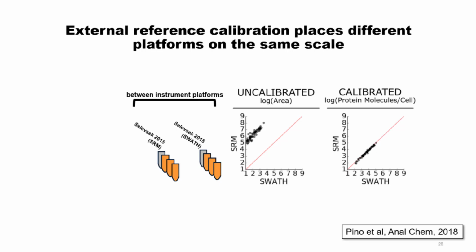But one thing that I'm trying to point out is that their data, when you use their own reference material in their sample, is extremely well calibrated and can be compared between the different instrument platforms.